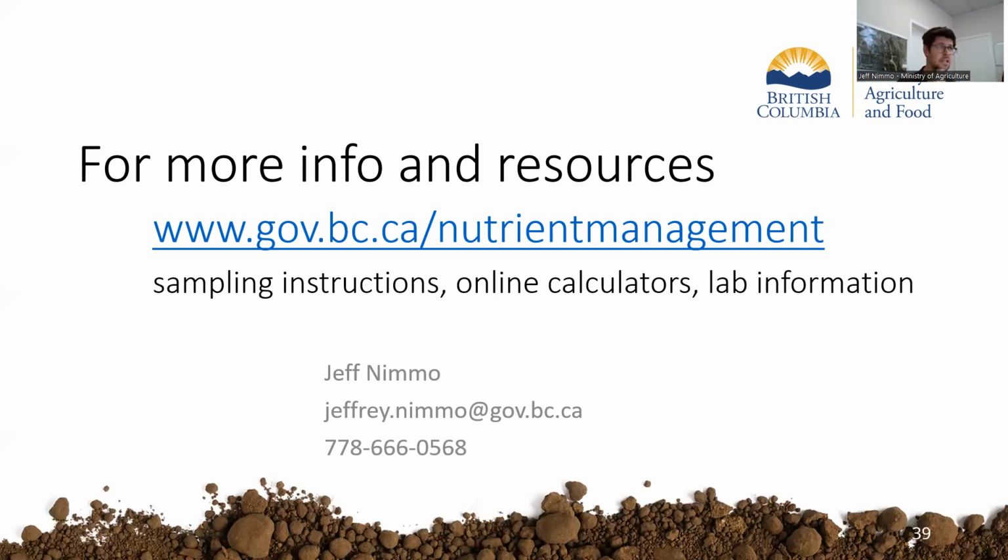If you do want to play around with soil test reports, our ministry has a couple of different online tools that are accessible to you. Some of them are for some of those conversions that I mentioned, but otherwise we have a broader nutrient management calculator that walks you through a lot of this process of inputting soil test results, getting ratings and evaluations back based on the BC Kelowna extraction values.